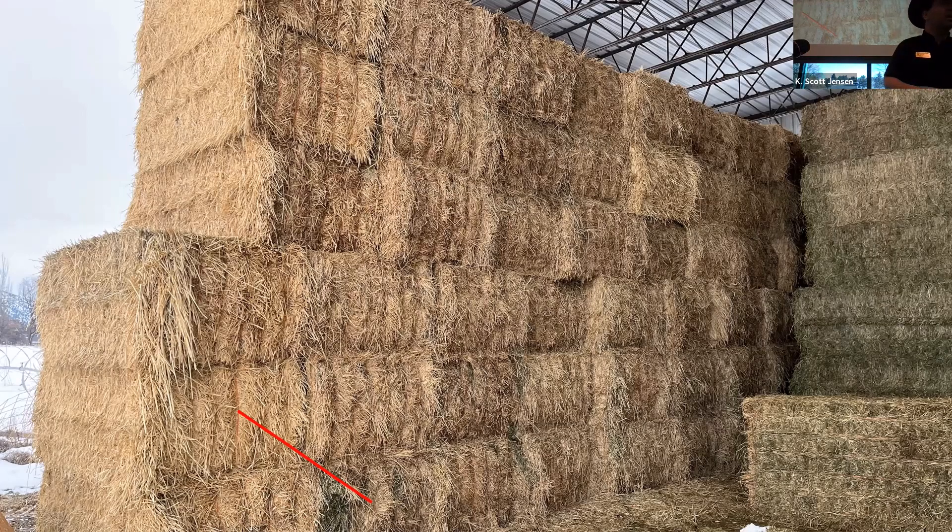You want to go in the middle of the bale. Besides avoiding weathered or moldy tops and bottoms, there's another reason: leaf concentration. During the baling process, the mechanical shaking causes leaves to fall off stems and migrate toward the bottom of the bale. If you sample too high you get more fiber and stem, which skews your energy and protein down and raises your ADF and NDF values. Going in the middle gives you a representative mix of leaf and stem.